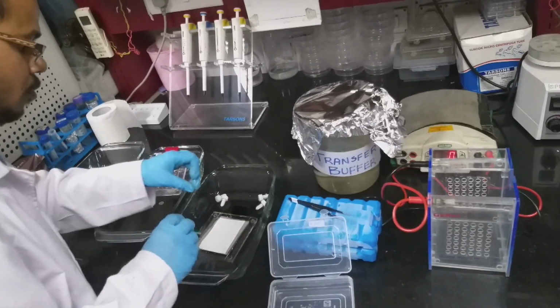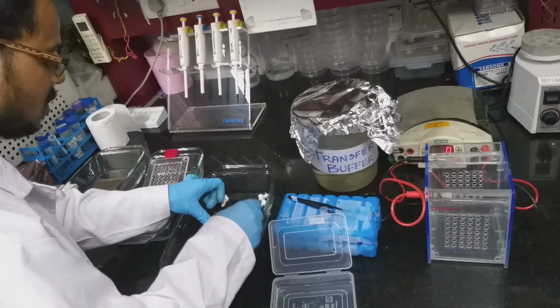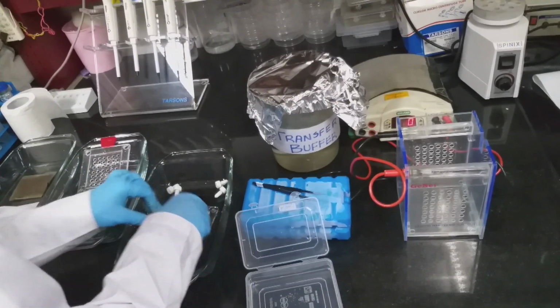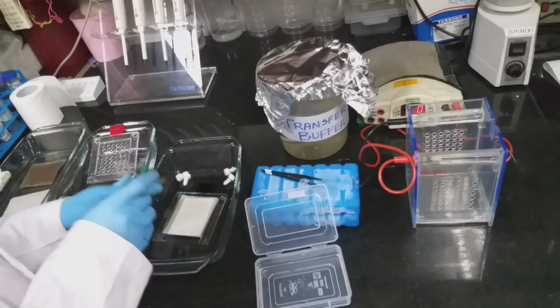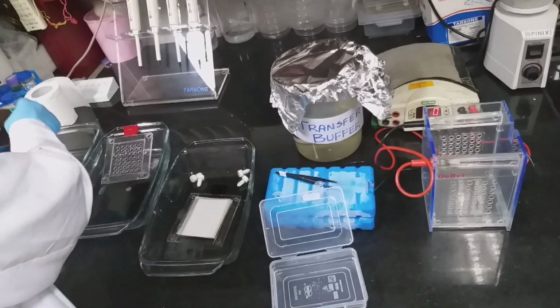Next we have to remove any air bubbles if present. We overlay with another blotting sheet and remove the air bubbles. Each and every time you introduce something, you have to remove air bubbles.